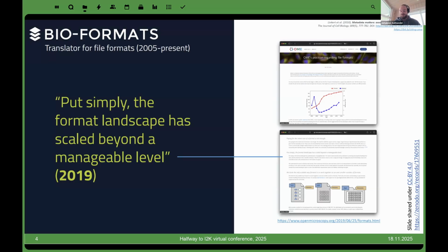Every night, there is a server that ingests a huge collection of historic image data from all sorts of file formats, making sure everything is still parsed correctly and can be read and written by the Bio-Formats tool, which is a huge effort in maintenance and continuing cost that somebody has to put in and that nobody really pays. So right now, the OME community has done this for the community, but it's getting a bit out of control. And there should be better solutions, really.